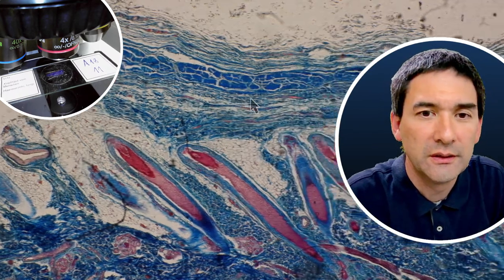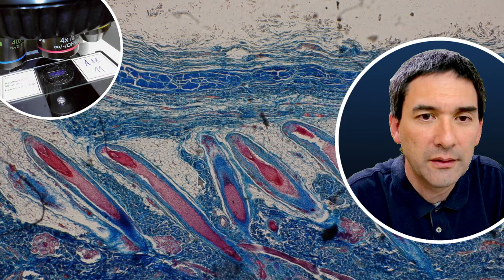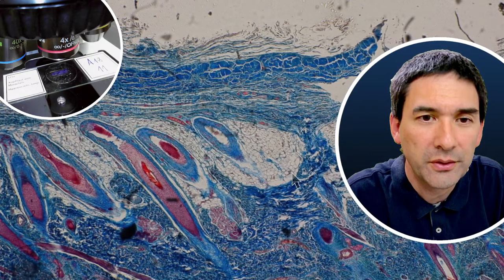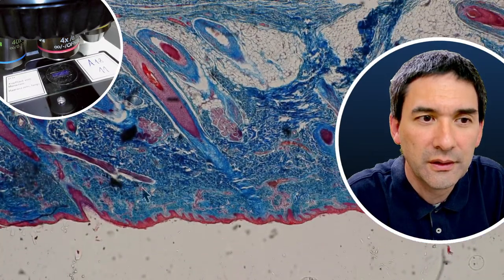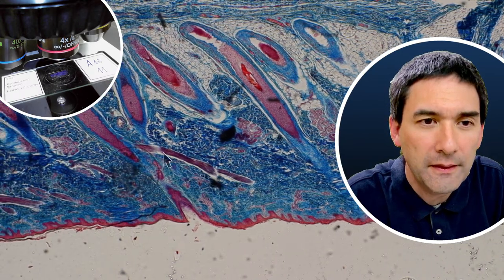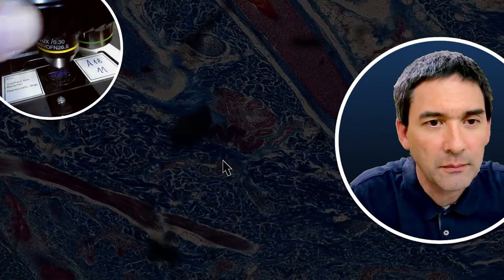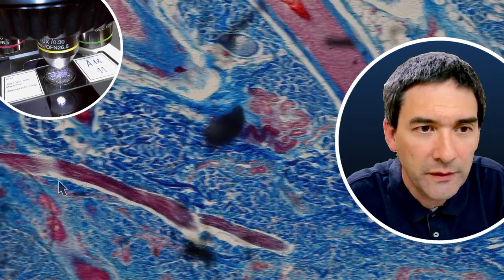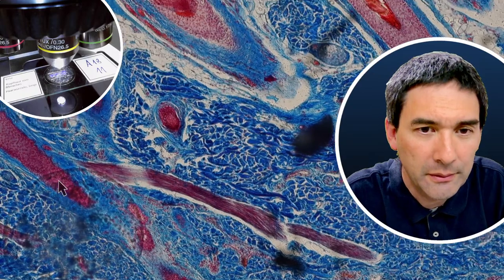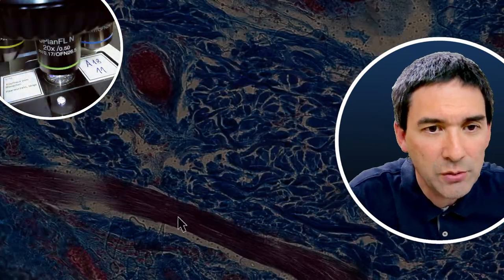You can actually see the red, colored in red, next to each other, all of the hair being formed. And this seems to be the surface here. And this over here, which is also quite interesting, seems to be a muscle that pulls on the hair. Let me have a look. Because when you're feeling cold, the hair starts to stand up and rises. This is because there are tiny muscles that actually pull on the hair, and this seems to be one of those muscles.